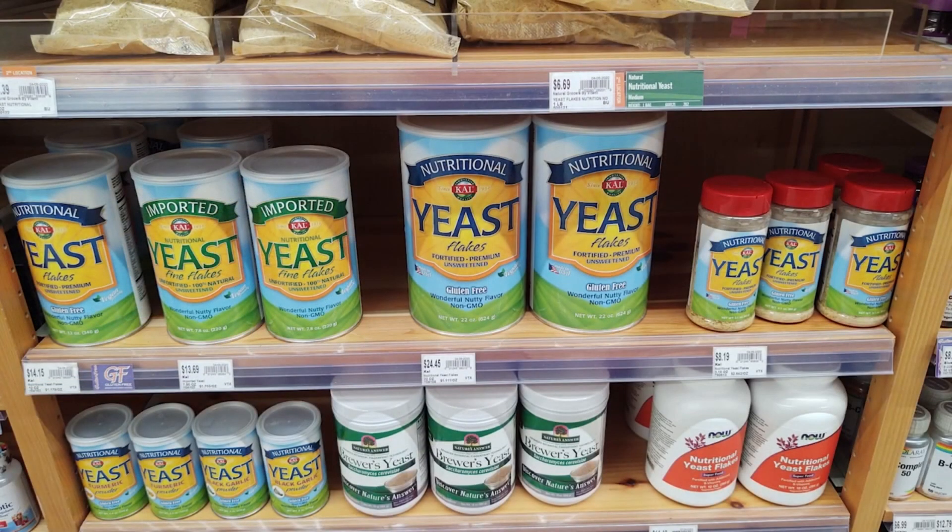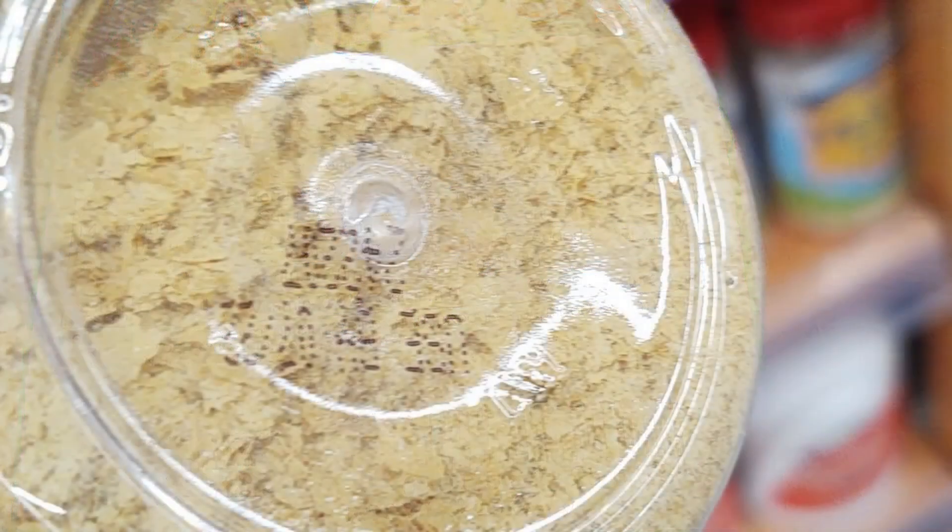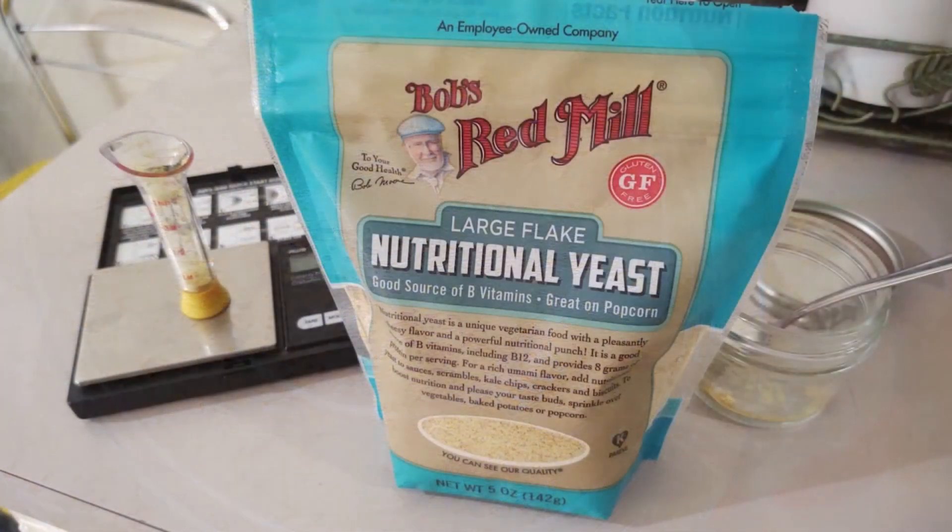Nutritional yeast can be found in most health stores or online and comes in various forms, from powdered to large flake. Both of these are good, but you do want to make sure you grind it to as fine of a powder as you can.